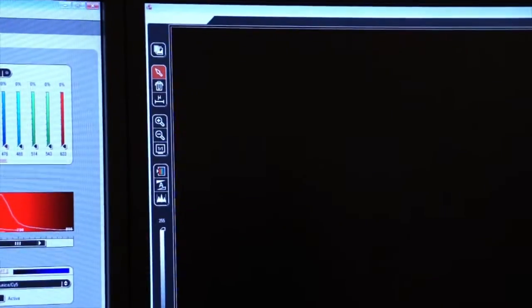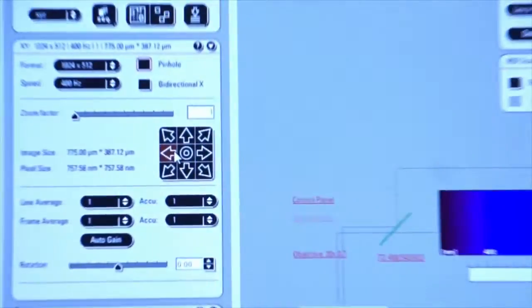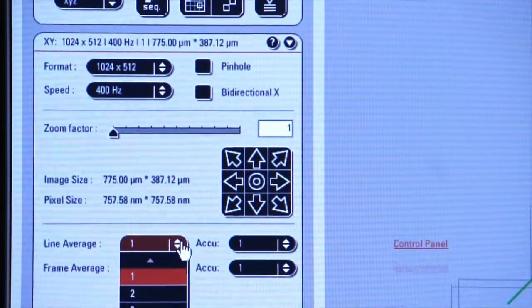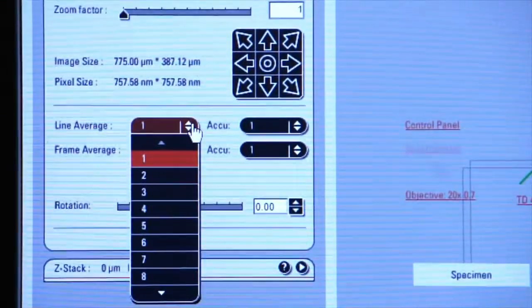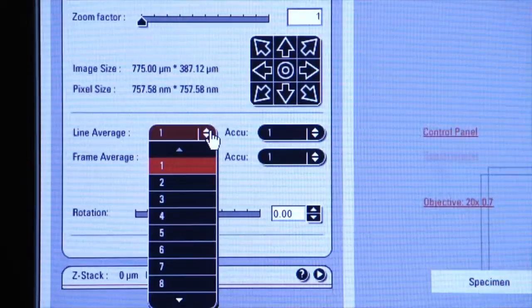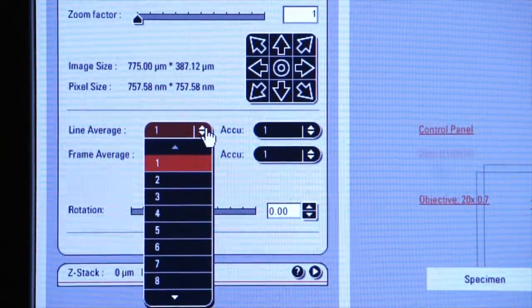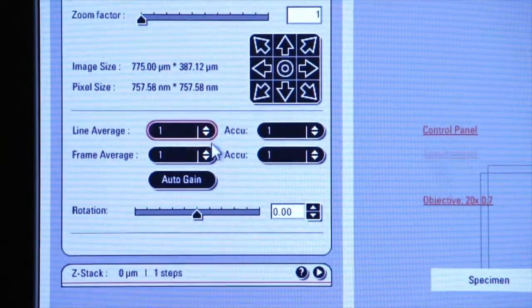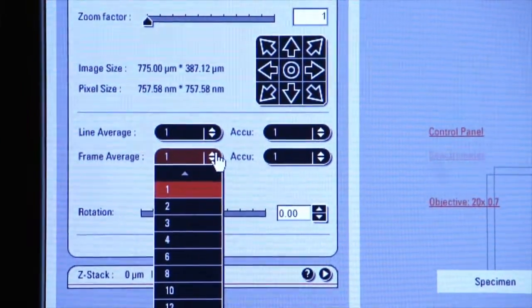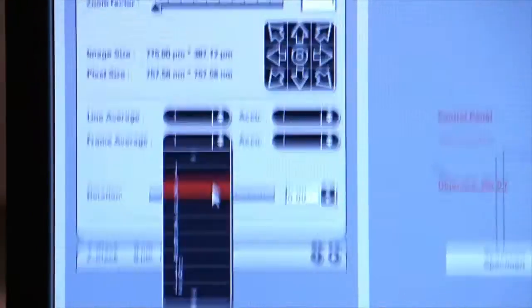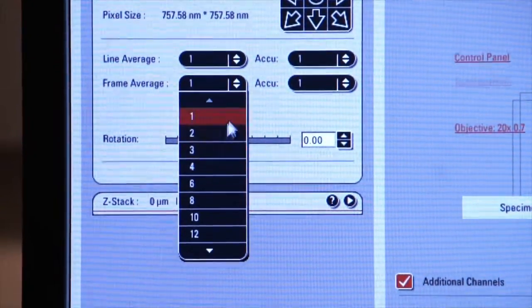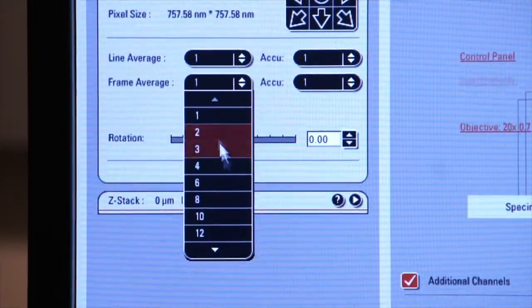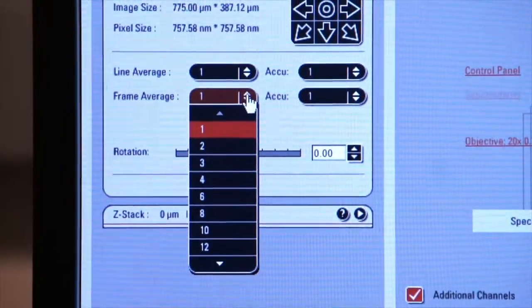We're also going to discuss line average, how to improve our images by doing averaging of each scanned line, and we will discuss frame average. In this instance, we will average each frame out a number of times according to the number we select. And that will decrease background noise, increase our signal to noise ratio, and clean up our image.